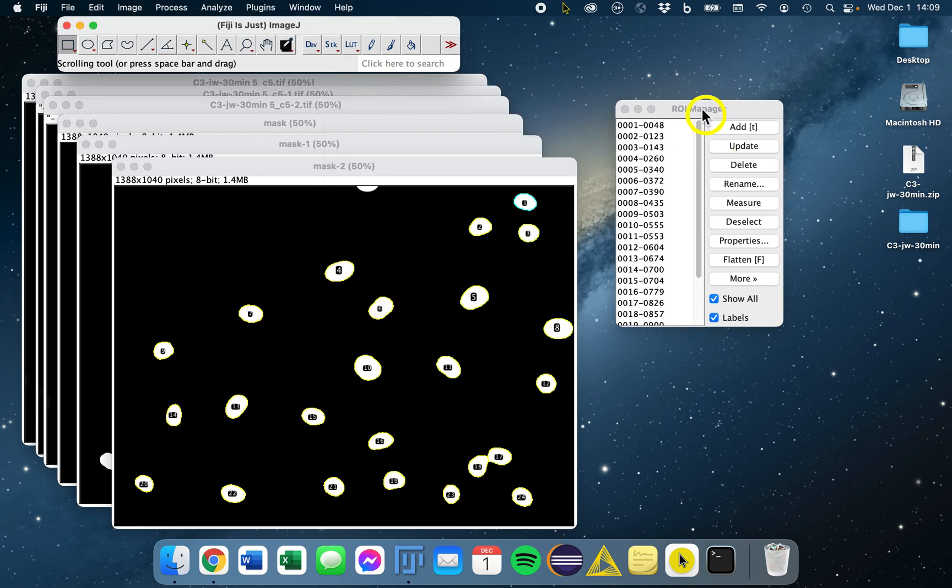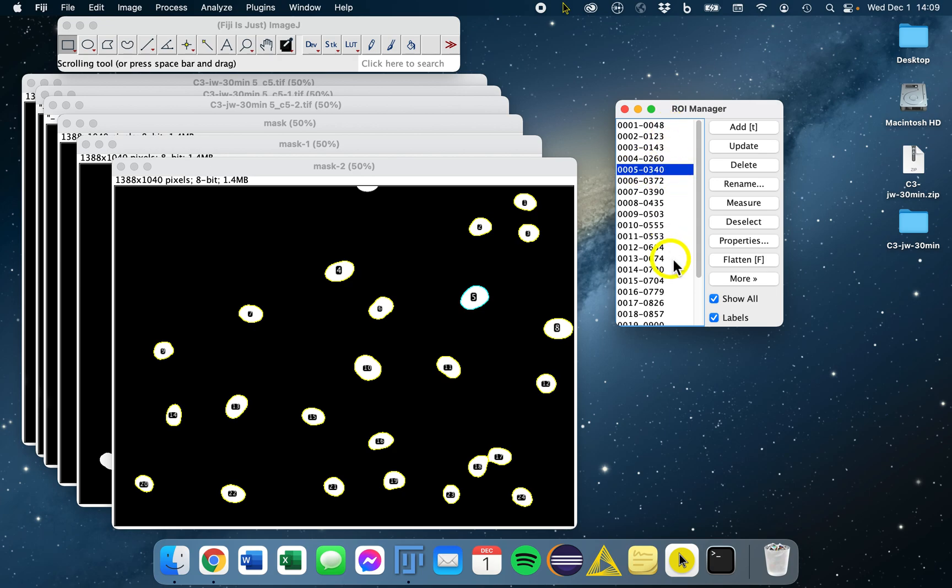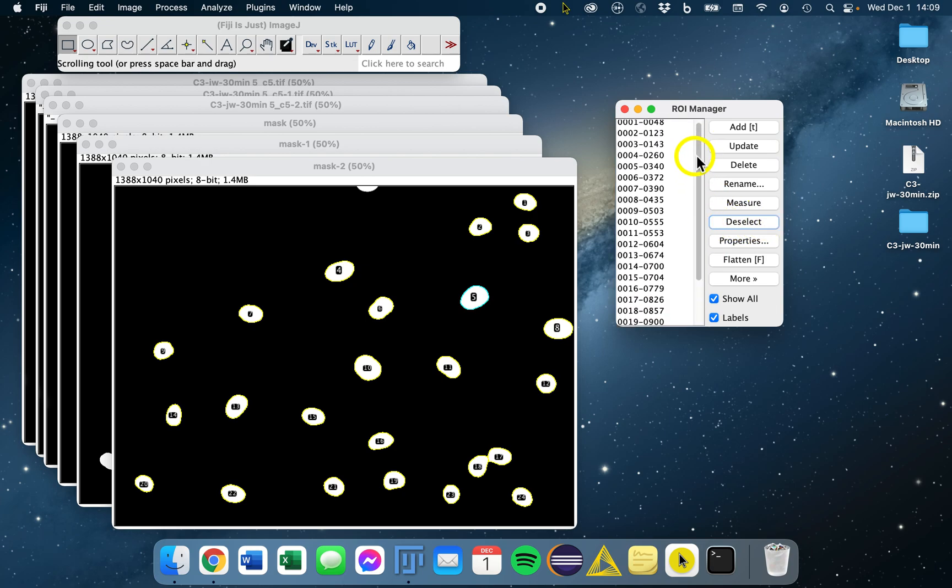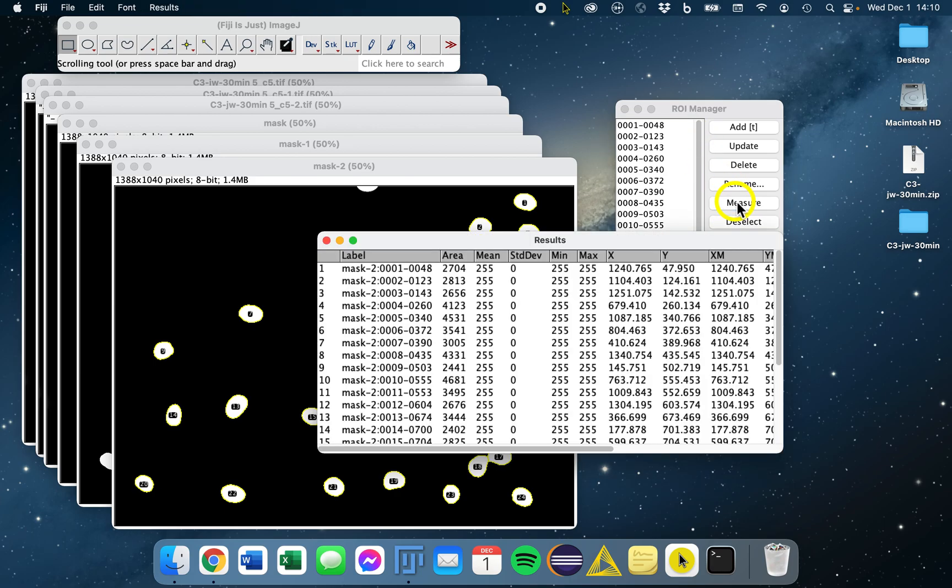So we go back to our ROI manager. If we highlight here, we can highlight individual ROIs, but we don't want to just measure that single ROI. In order to ensure that we measure everybody, the best thing to do is first click deselect to ensure no one is selected, so we won't just measure one. And then measure, and we'll measure all the ROIs.